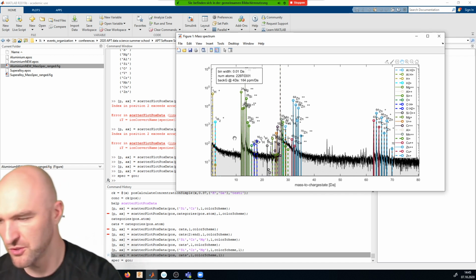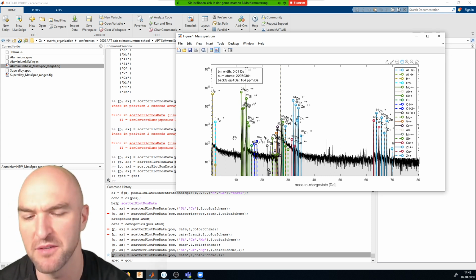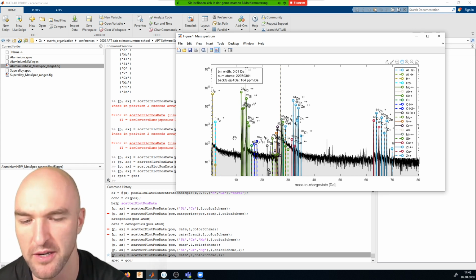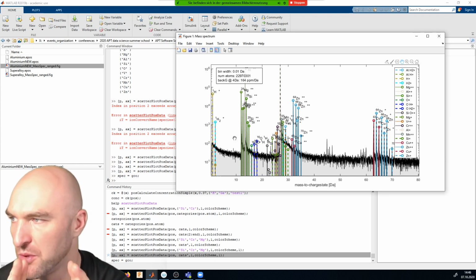I was thinking to probably do weekly updates in the same format as we have now, because we are obviously also going to be adding more functionality, especially when it comes to interface analysis and the like. So it's probably good to just have a fixed hour every week where we can go through questions and also introduce new functionality. Is anyone apart from Florent that could not open the MATLAB live scripts at all? Because the problem with Florent was that Florent really couldn't open it at all.